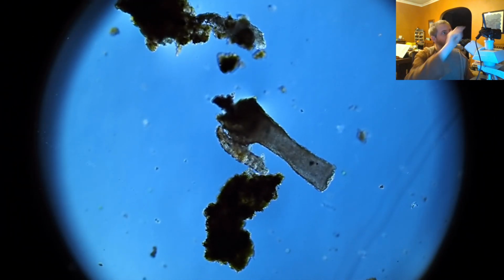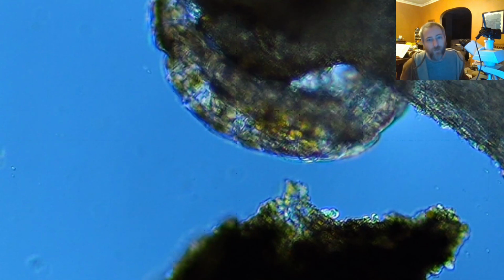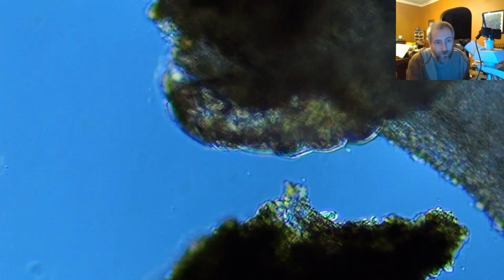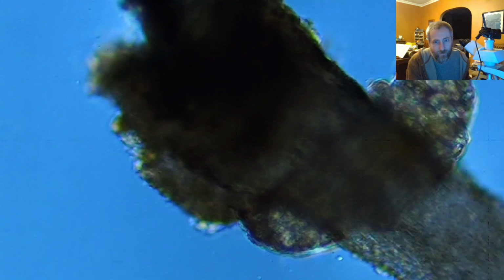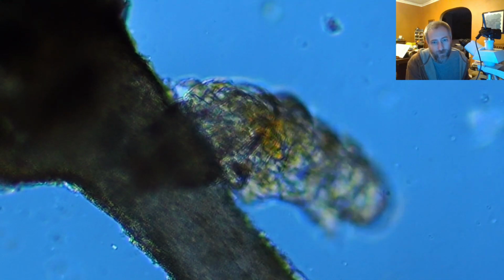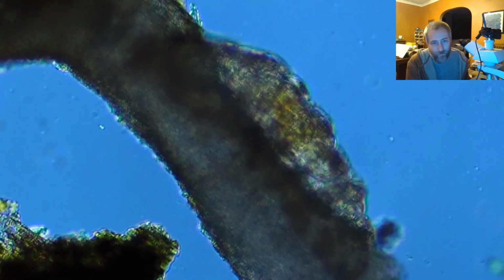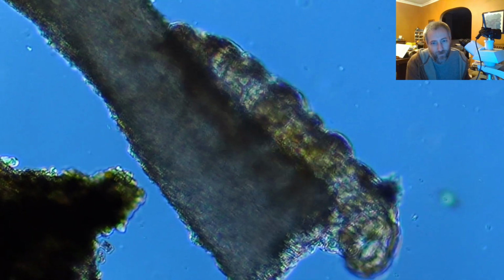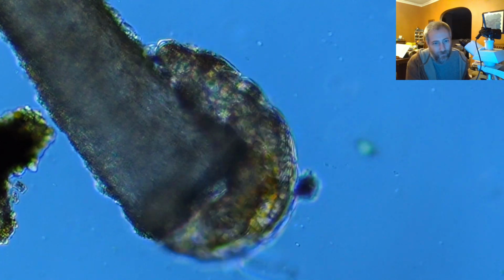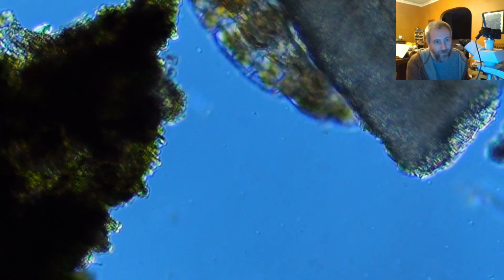Let's see if I can kind of get in close and showcase that for you. So it's going to be hard because they're always crawling around, and when I get zoomed in, their sort of 3-dimensional nature starts to stand out, but you can really see their legs sort of kicking right there. And then, of course, their mouth has a little snout, little newt snout, and you can see at the ends of each one of those little legs, hopefully, some sort of claw-like structures. The back legs, so you could see them there for a second.